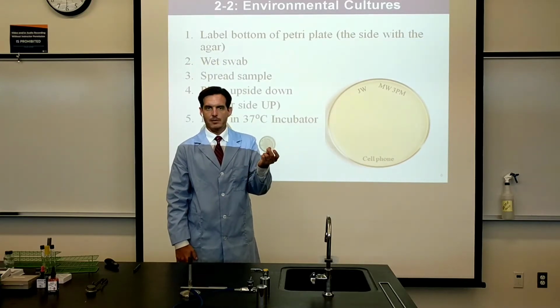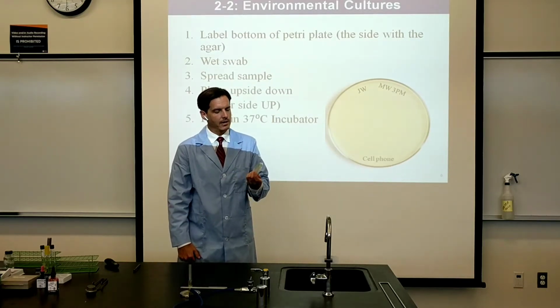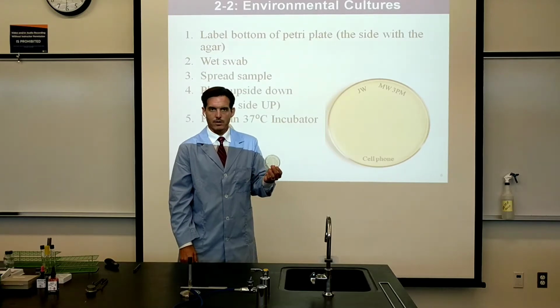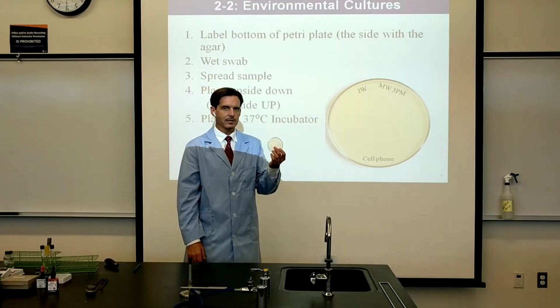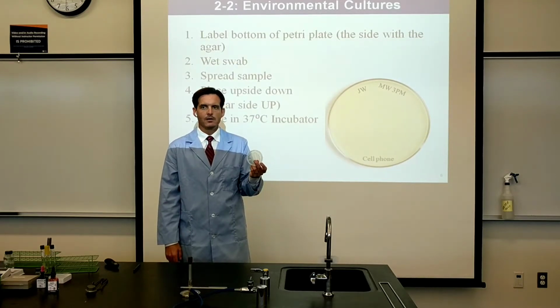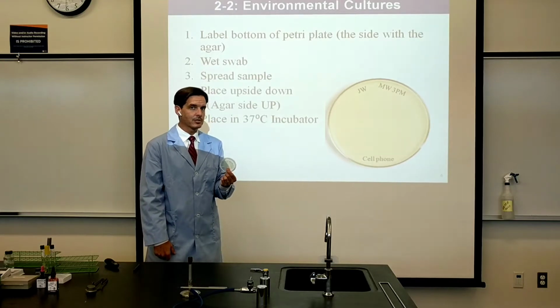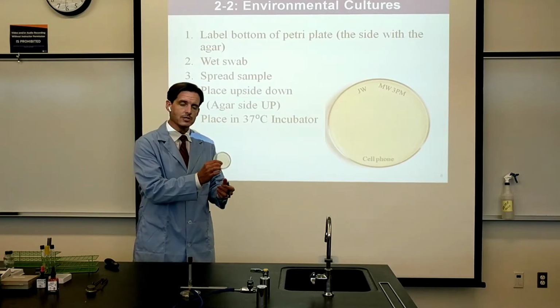If we had put this sample outside for 20 minutes, which would be sort of a control by comparison that we could have put out, typically we would see some growth, whether it would be some random mold spores, so you'd have some fungus that could grow in here, maybe some bacteria that are blowing around in the air as well. So this was a little bit anticlimactic, but that doesn't mean that there's nothing on here growing. Remember, we've only been growing these plates for 48 hours in the incubator at 37 degrees Celsius. So I'm going to leave this plate over the weekend, but at room temperature, and we're going to see if more bacteria grow, or some bacteria, or maybe some fungi.